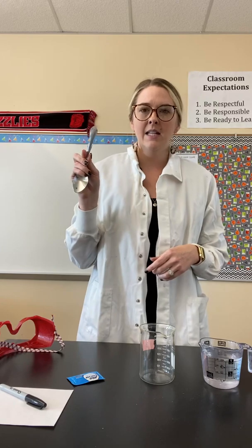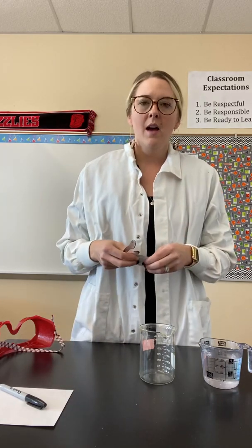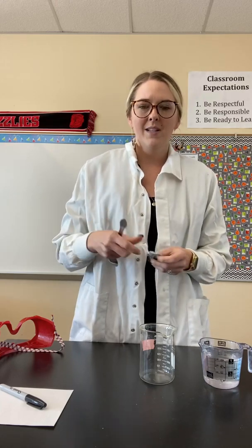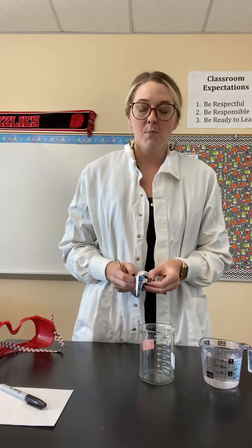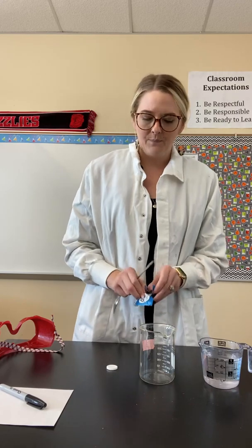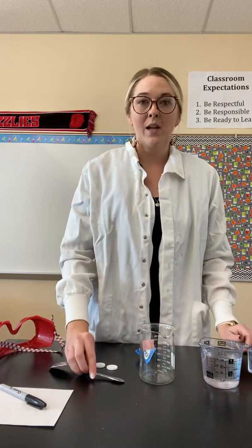Last thing, I needed something to score my Alka-Seltzer tabs with. This is just gonna help me not cut all the way, but just help me break the Alka-Seltzer tablets into the pieces that I need. So we're gonna do that, and we're gonna get going on the lab.